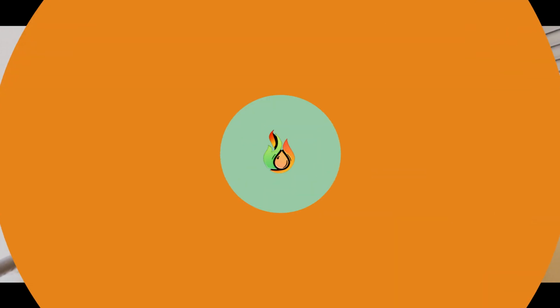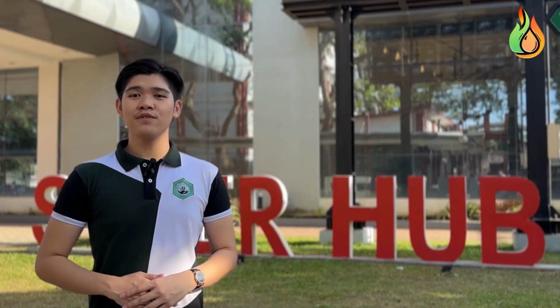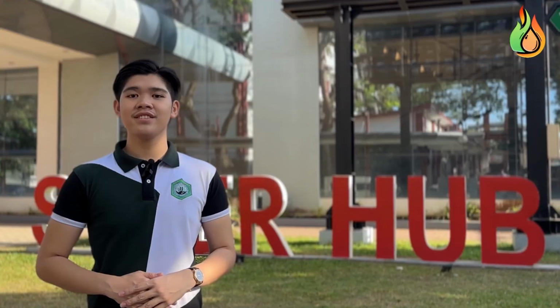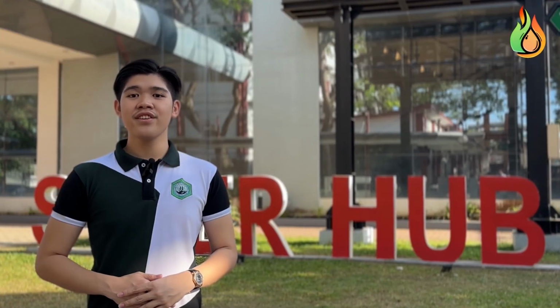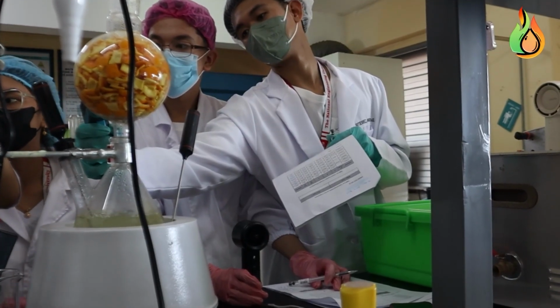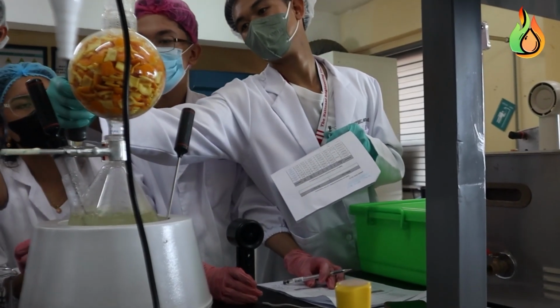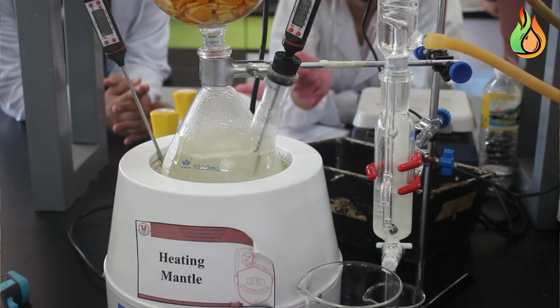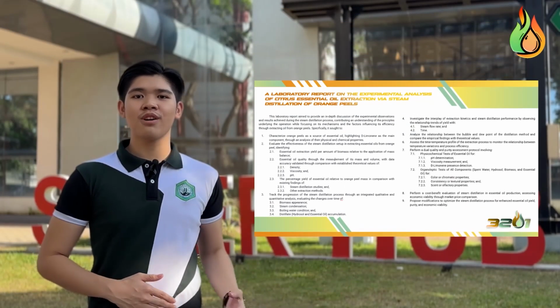We've explored the extraction process, but the real test lies in the result. Are the extracted oils meeting the expected quality and purity standards? As we analyze the laboratory findings, we uncover surprising insights. The extraction of essential oil from the orange peels serves to provide an understanding of the principle of steam distillation and its application in oil extraction. This includes closely examining the experimental observations and results obtained during the process, and focusing on its mechanisms and the factors influencing its efficiency. With this in mind, the following objectives were sought through the experiment.